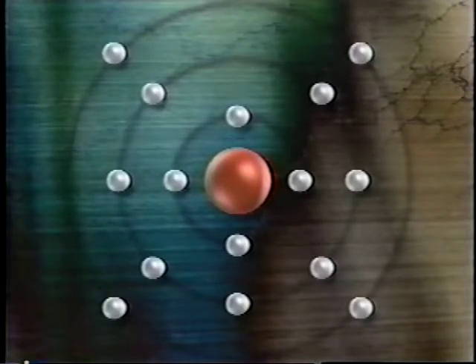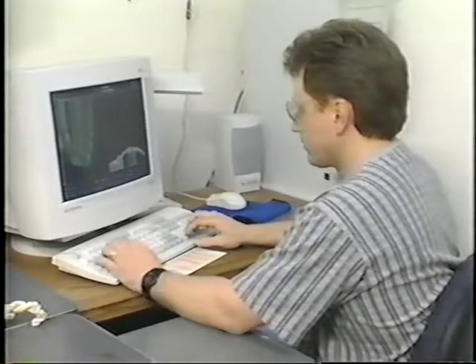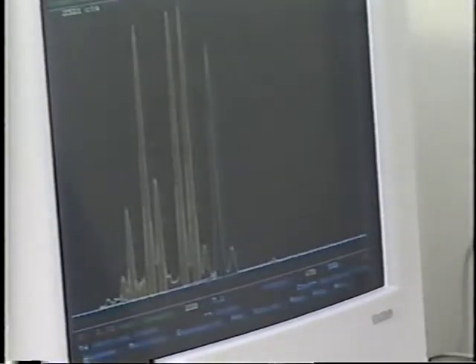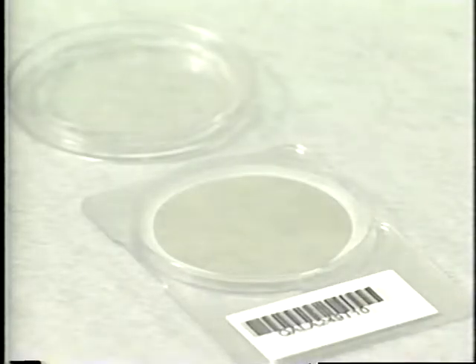of the element. These concentrations are quantified by comparing photon counts for a sample with those obtained from standards of known concentration. Since emitted photons can be absorbed in a filter or heavy deposit, thin membrane filters with deposits in the range of 10 to 50 micrograms per square centimeter provide the best accuracy and precision for XRF analysis.